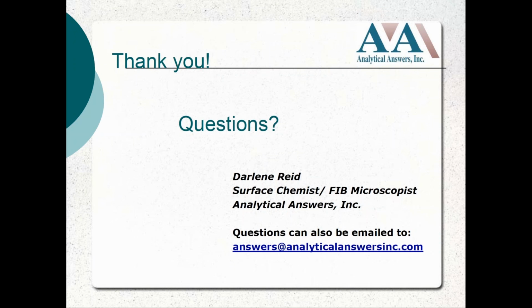Just the hydrogen analysis question. What do you recommend for hydrogen analysis? So for hydrogen analysis, that requires a different technique. I can get back to you through an email with the particular analysis needed for that, but if you wanted to analyze organics, FTIR is an ideal technique for that. But for hydrogen analysis, the acronym is escaping me at the moment, but I can reply by email with what the ideal technique for that is.